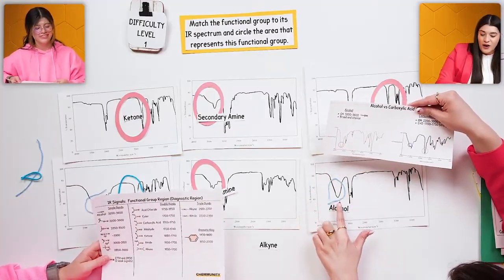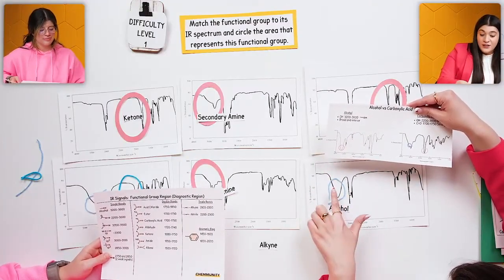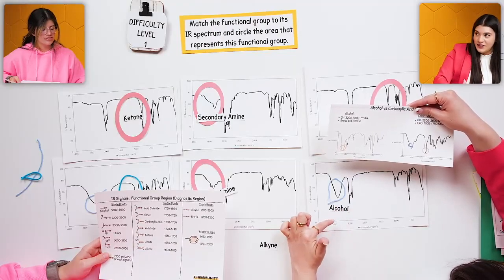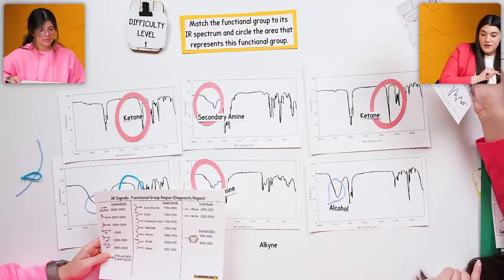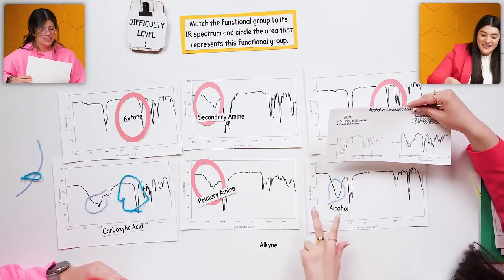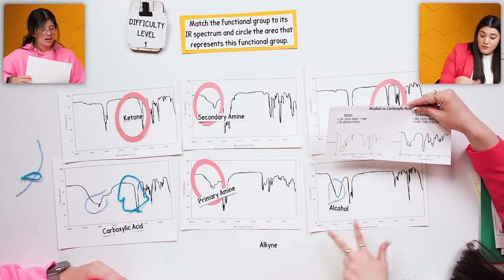We saw that this was broad. It might not be too intense, or strong, because it's not as low down, compared to these that we've seen. But it is broad. It is kind of fatter, as you can think of it. It's not narrow. So that's really it.